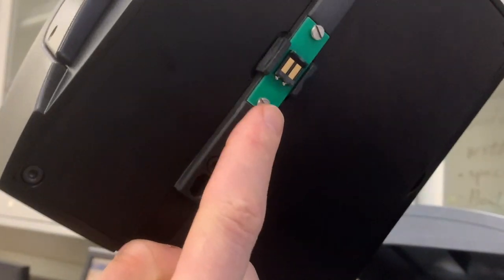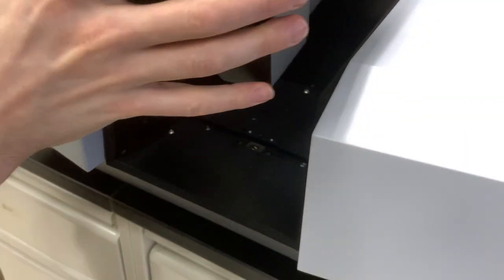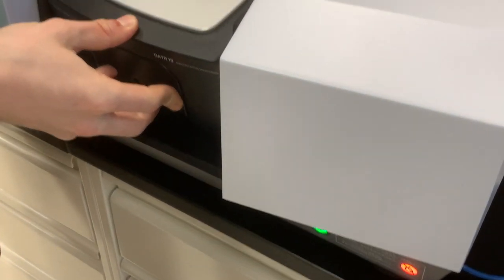So really just so you can actually see, this sensor on the bottom is going to attach here. Okay. And that's how the instrument knows that the ATR accessory is attached. Yep, exactly. This is a click in, I assume? Yeah, okay, gotcha.